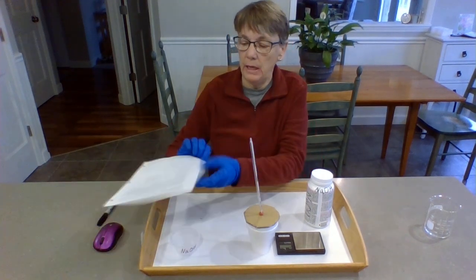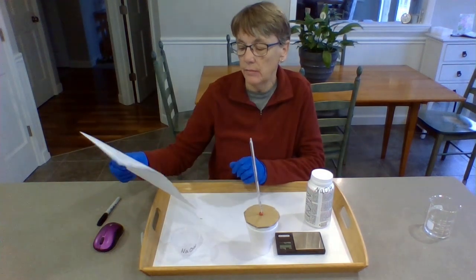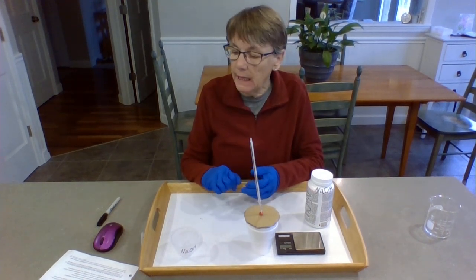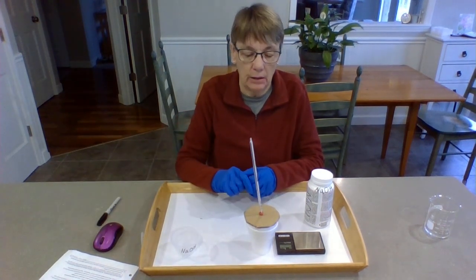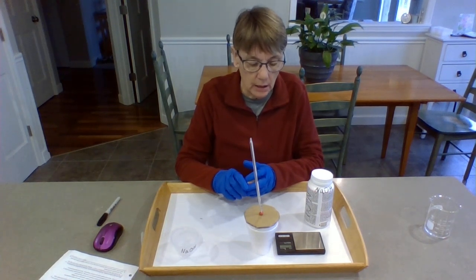So that would be step 11 on your worksheet. So that's it. That's how to perform that experiment. Now, with all the data that you have, you should be able to determine how much heat that actual reaction produced.